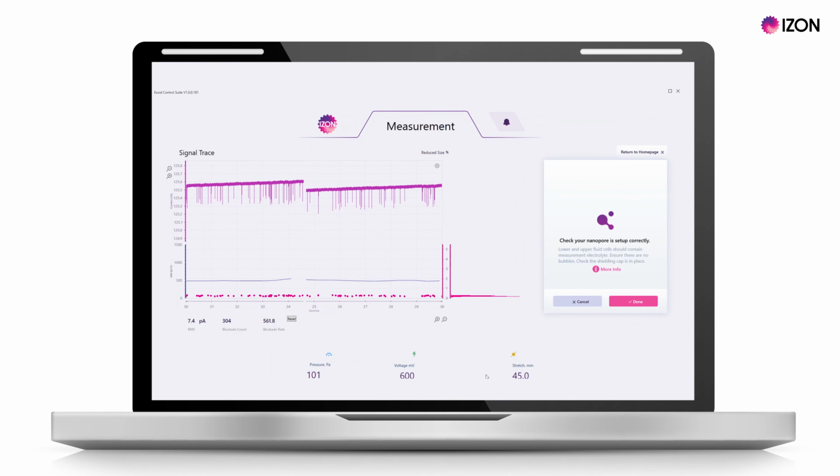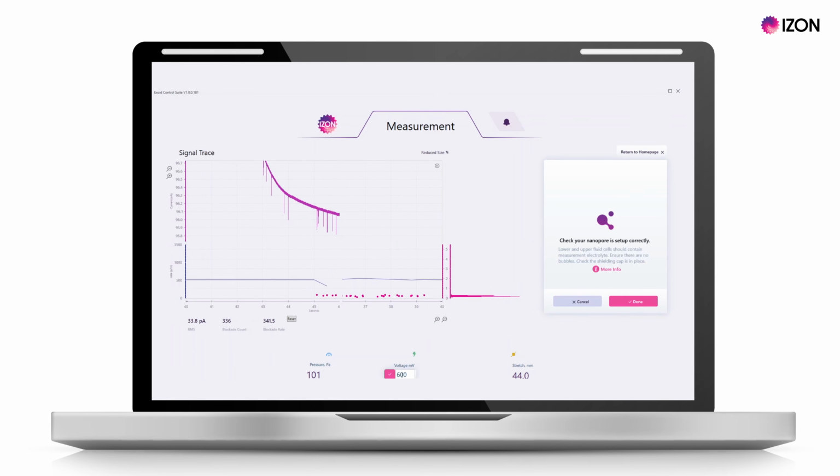Now, if we reduce the stretch even further to 44mm, the current drops as the nanopore contracts, and by changing the voltage to 800 millivolts, we return the current to 127 nanoamps. And you can see the same blockades are now on average 0.3 nanoamps in size. Every nanopore is unique, so the magnitude of this change as you stretch or de-stretch the nanopore will vary. But in general, you should be able to resolve smaller particles better when your signal-to-noise ratio is increased. There is a chance that at lower stretches, your nanopore may be more prone to blocking.